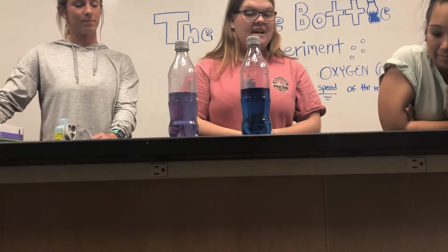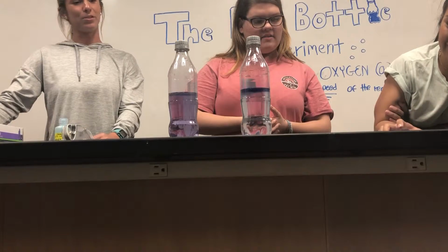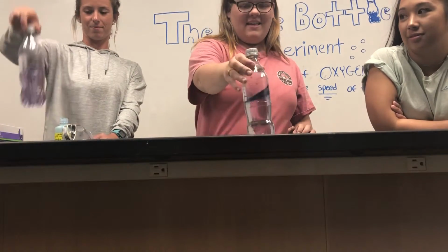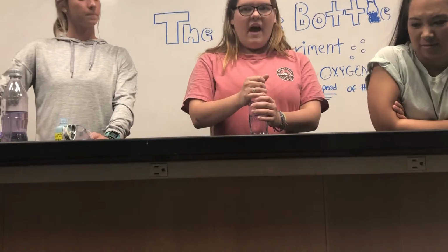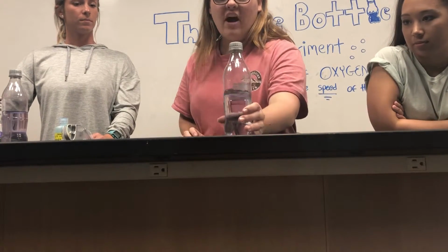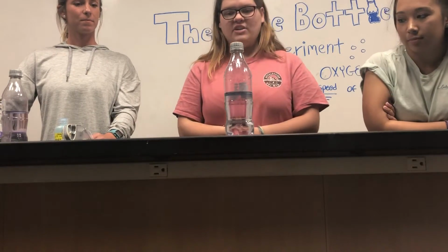So we're approaching 40 seconds, which is what the first one took. And it's starting to go a little bit longer. About 2 seconds. So that one took about 3 seconds longer, and this one is still purple. So you could really see when we shook it about half the number of times, that was about 8 seconds, and then the second time took about 3 seconds longer. And again, that's due to the higher concentration of oxygen that we put inside the solution. So it takes a lot longer for the glucose to reduce the oxygen in this reaction.